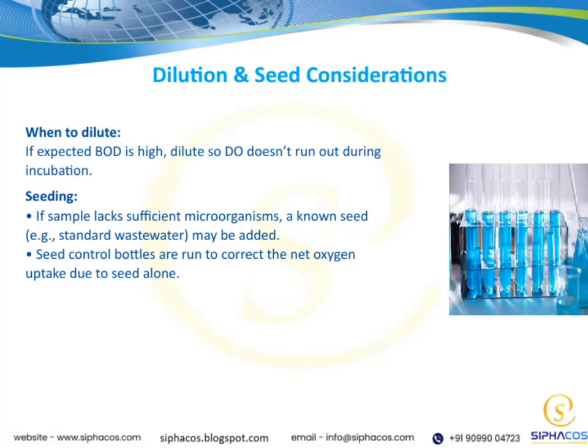Let's talk about dilution and seed considerations. First, when should we dilute our samples? Well, if we expect the BOD to be high, it's a good idea to dilute the sample. This helps ensure that the dissolved oxygen doesn't get completely consumed during incubation, giving us more accurate results.